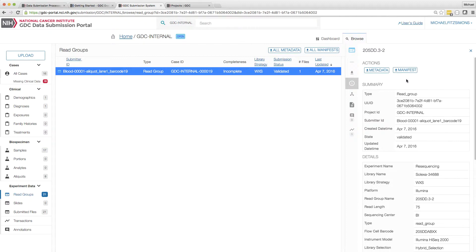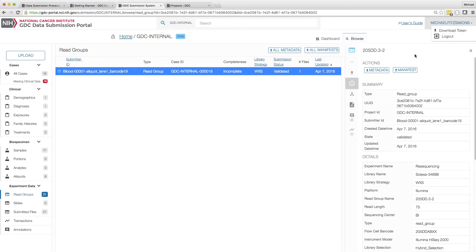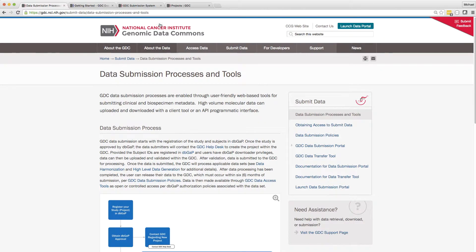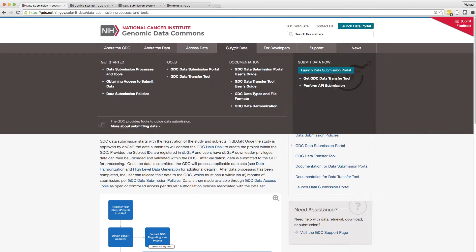Submitting data to a project in the GDC requires authentication, which is tied to a user's dbGaP credentials. Such authentication is provided to the DTT through use of a token, which can be downloaded here. Additional information on data access can be found on the main website under Obtaining Access to Controlled Data or Obtaining Access to Submit Data.